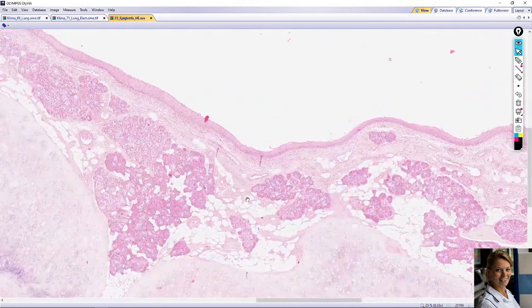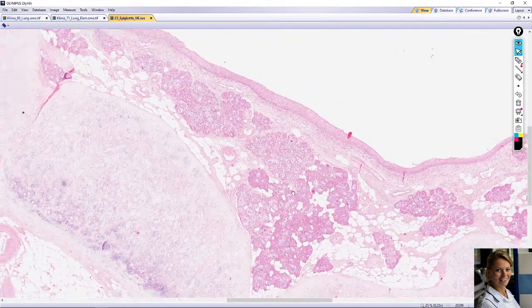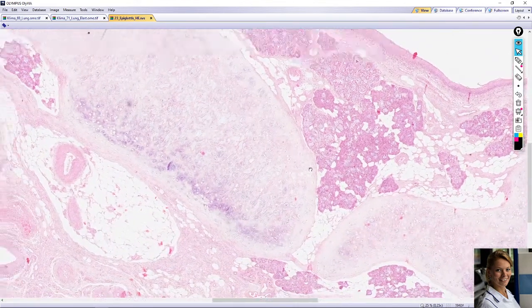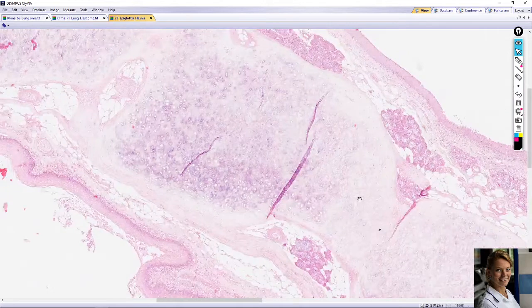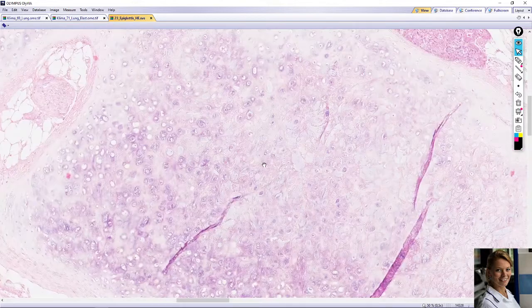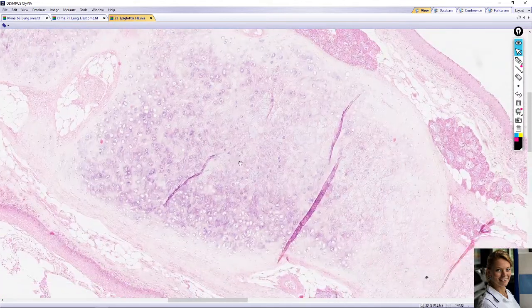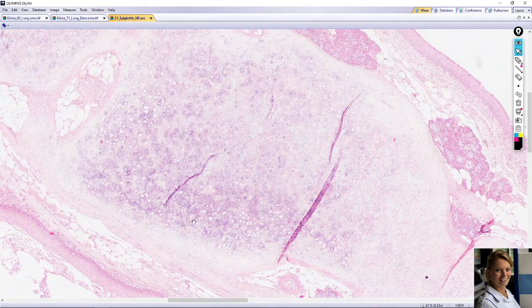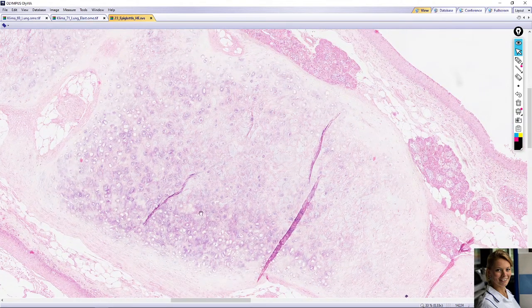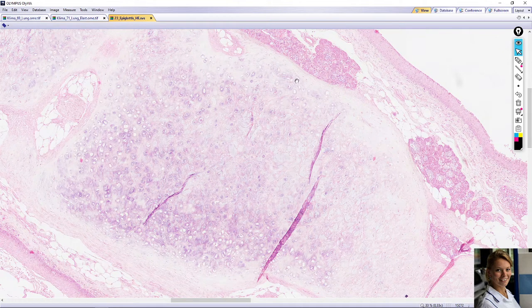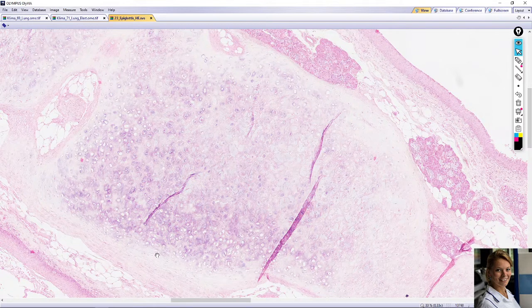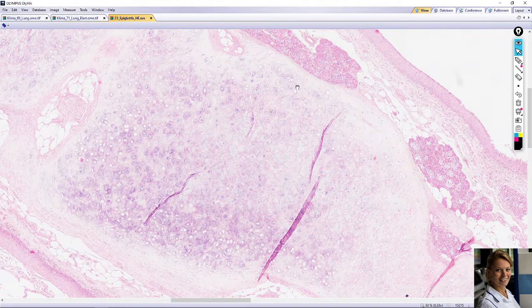So this is the lamina propria with the seromucous glands. The framework of the epiglottis is formed by elastic cartilage. Here is the elastic cartilage, which is covered by a perichondrium — here is the perichondrium on this side, and the other side is also covered by perichondrium.